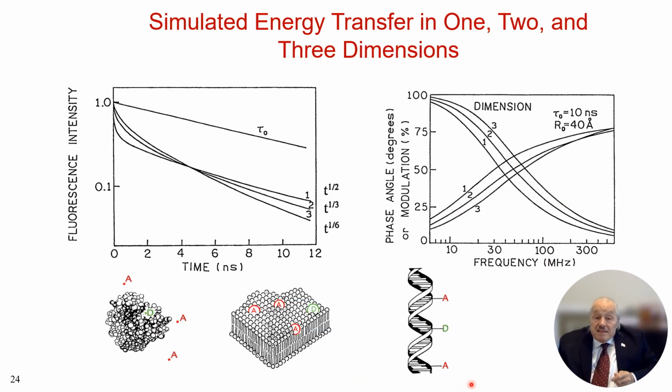The intensity decays in the 3 dimensions will look different if you could collect them perfectly. Of course, we have the unquenched decays, but it's easier to see in the time domain decays.